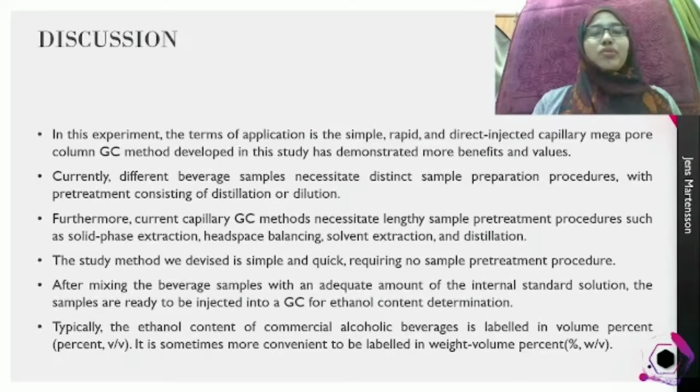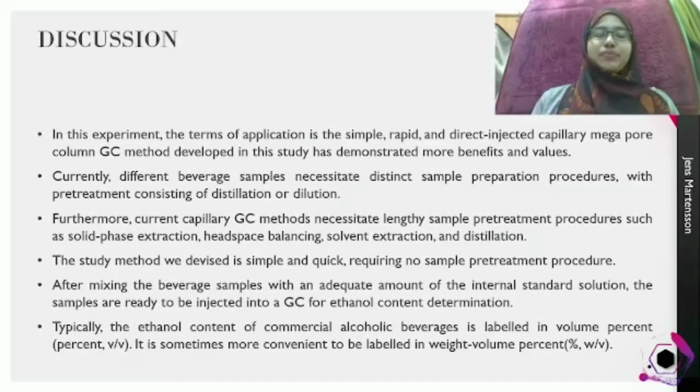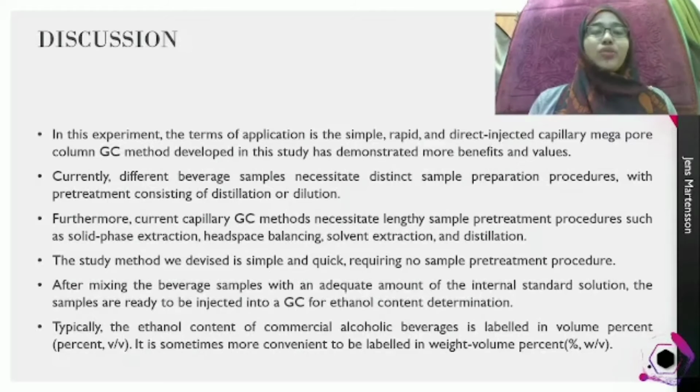Currently, different beverage samples necessitate distinct sample preparation procedures with pre-treatment consisting of distillation or dilution. Furthermore, current capillary GC methods necessitate lengthy sample pre-treatment procedures such as solid phase extraction, headspace balancing, solvent extraction, and distillation. The method we devised is simple and quick, requiring no sample pretreatment procedures.